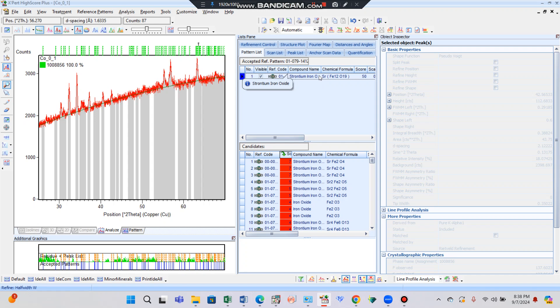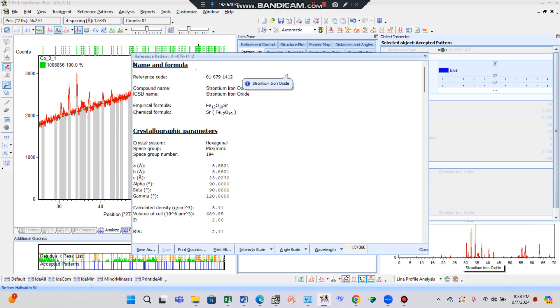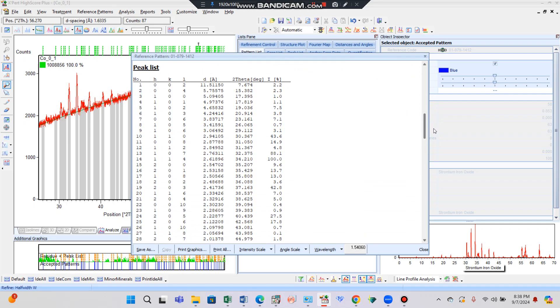Double-click this graph and you will get the name and formula, reference, chemical formula, and crystallographic parameters. The crystal system is hexagonal, space group P 63/mmc, space group number 194. The values of lattice parameters a, b, c and the corresponding angles alpha, beta, gamma, and the calculated density and volume of the cell are all available in this JCPD card.